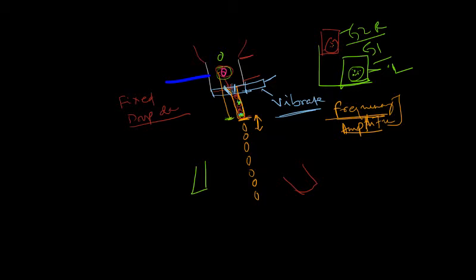As the stream is about to break in the system, it applies a charge. There are electrodes associated with the flow cell, one electrode providing positive charge and the other providing negative charge. So it can charge, and this can discharge, and this can apply a further negative charge.